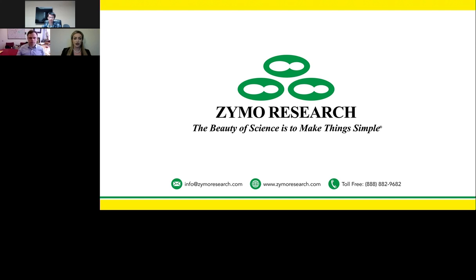And our next question is going to be for Dr. Mason. Do you think more species are needed in future controls? So I think we've seen a lot of controls for bacteria and also for fungal species, but I think absolutely there's a lot of mystery still on how you get accurate parasite identification or other species. Obviously, plants can be very complicated and even be polyploid, so you can have octoploid species, which can complicate some of the measurements. So definitely when you get into broader looks at what's in environmental samples or complex clinical samples, I think more species will be better.